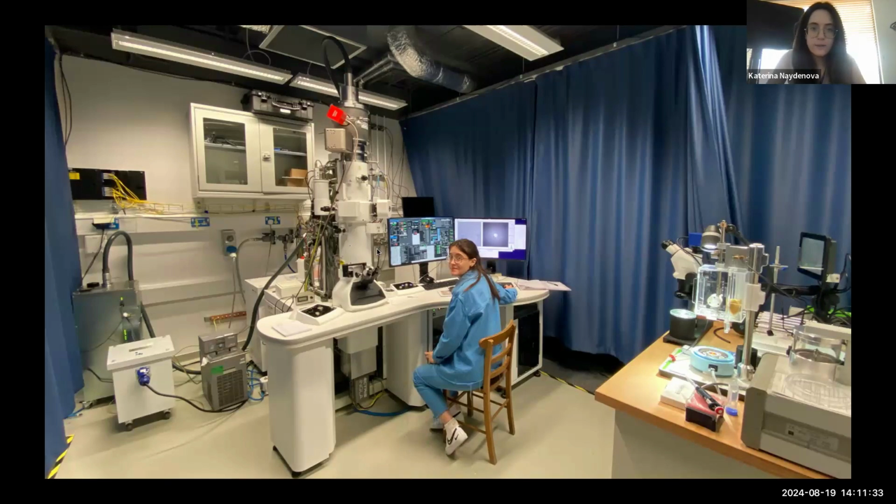Just a quick side note, this is a part of our cheap cryo-EM lab. We have 3 of these microscopes sitting in one room, separated by these curtains. As you can see, they don't really require a lot of space. They're not very tall, so they fit in some more standard rooms. And we're also working on tools for cryo-EM sample preparation that are also cheap and accessible.